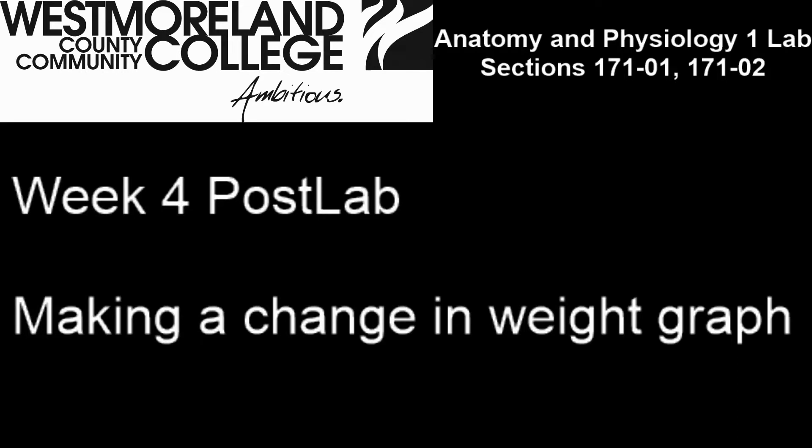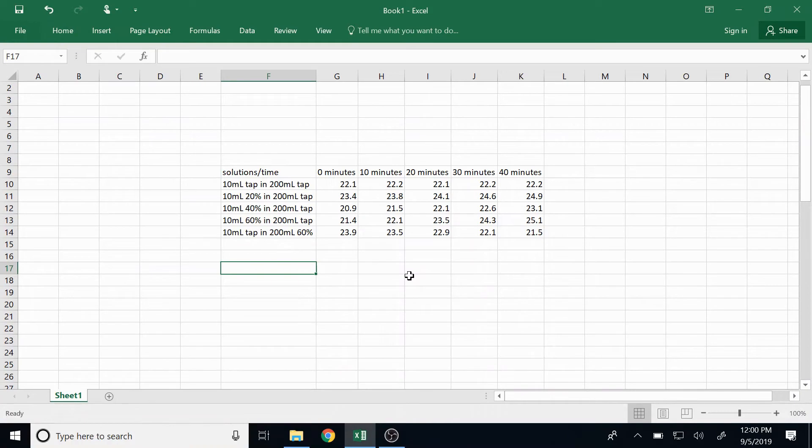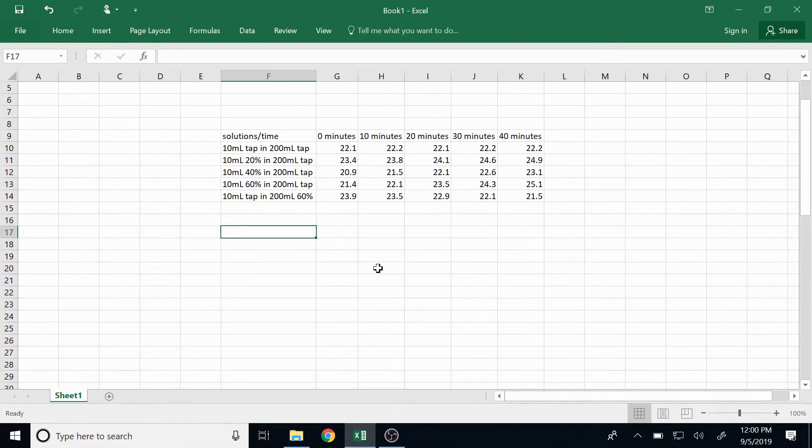To start out I'm going to build a table the same way that I did for our previous graph building exercise. All I've done is made the graph that you might already have or might need to construct in Excel. It's the data that we collected over the 40 minutes in the lab experiment.